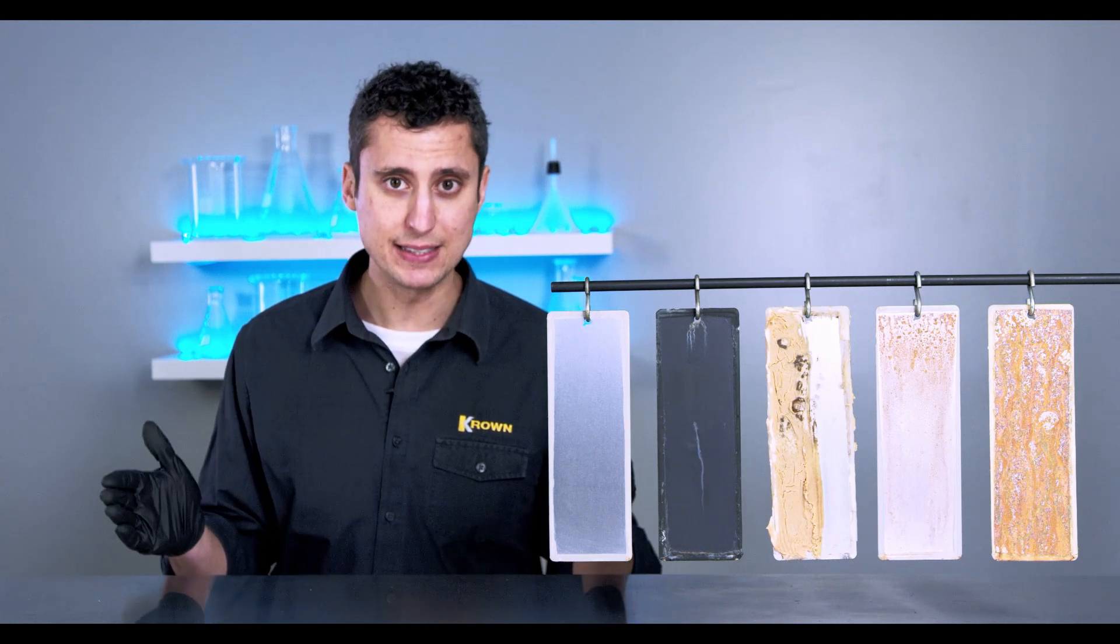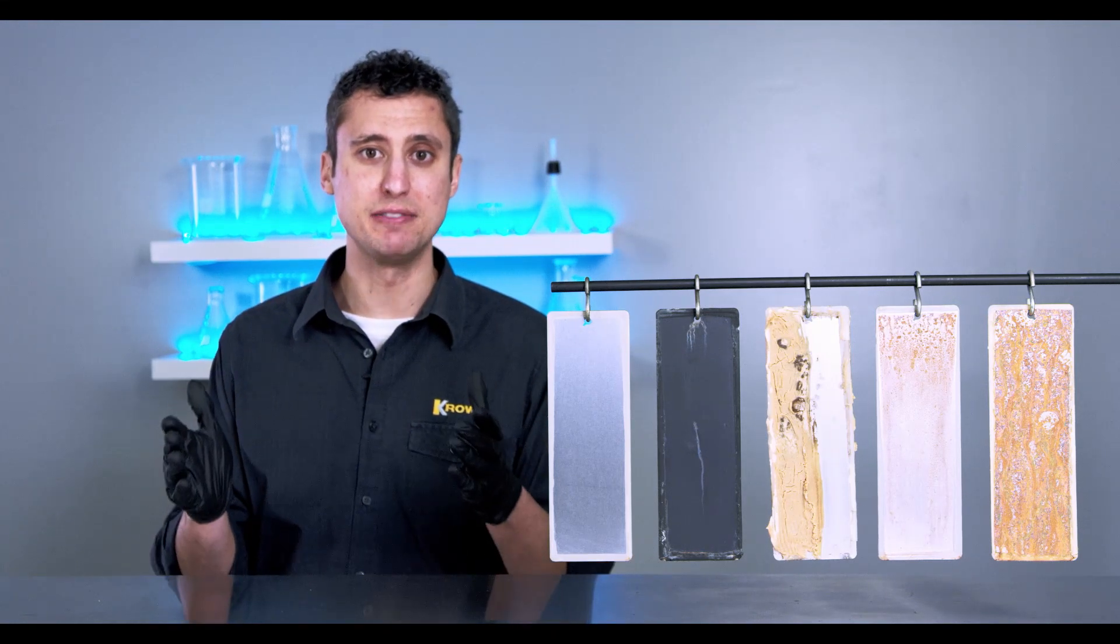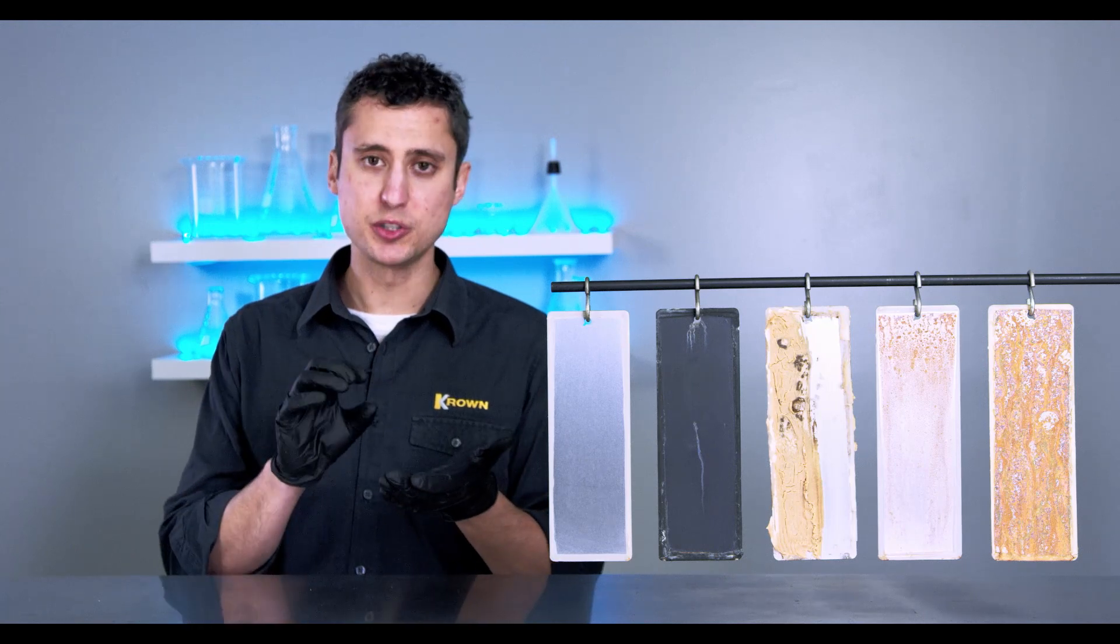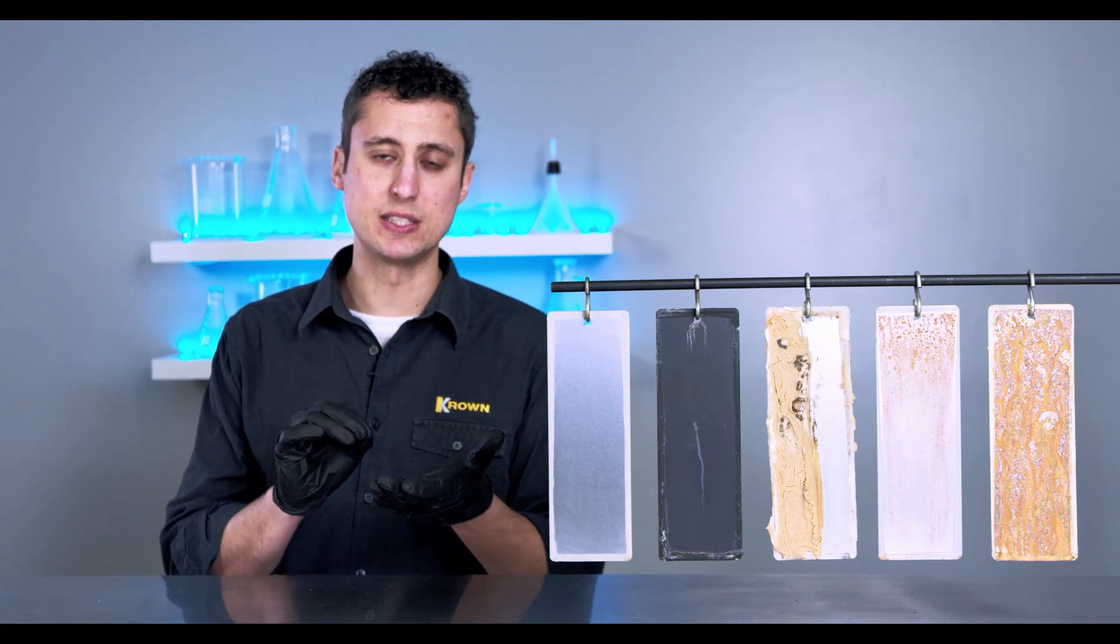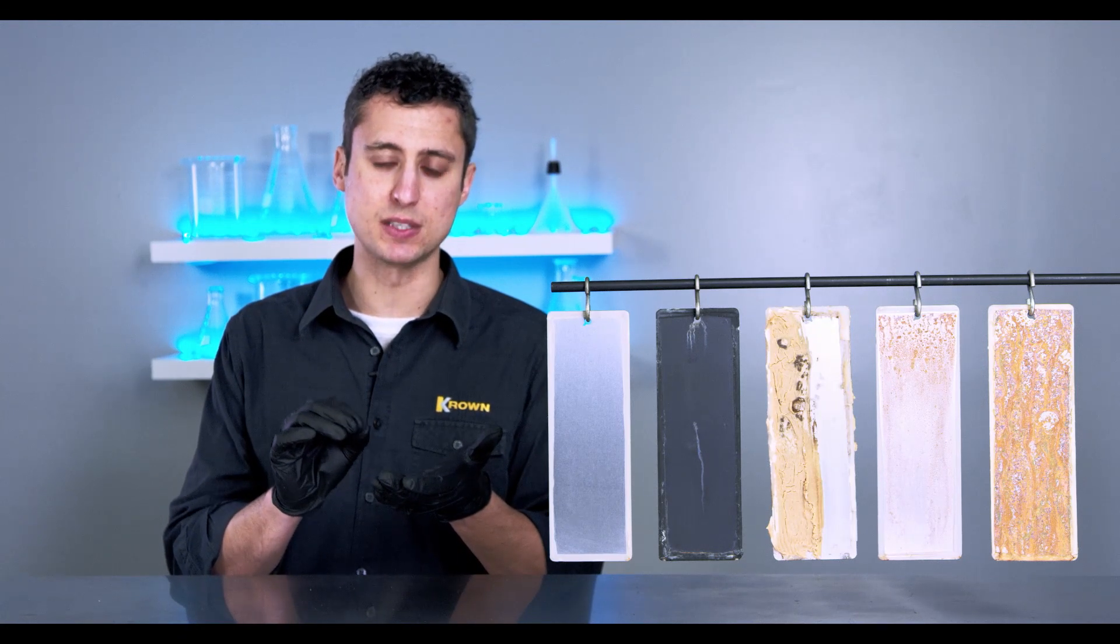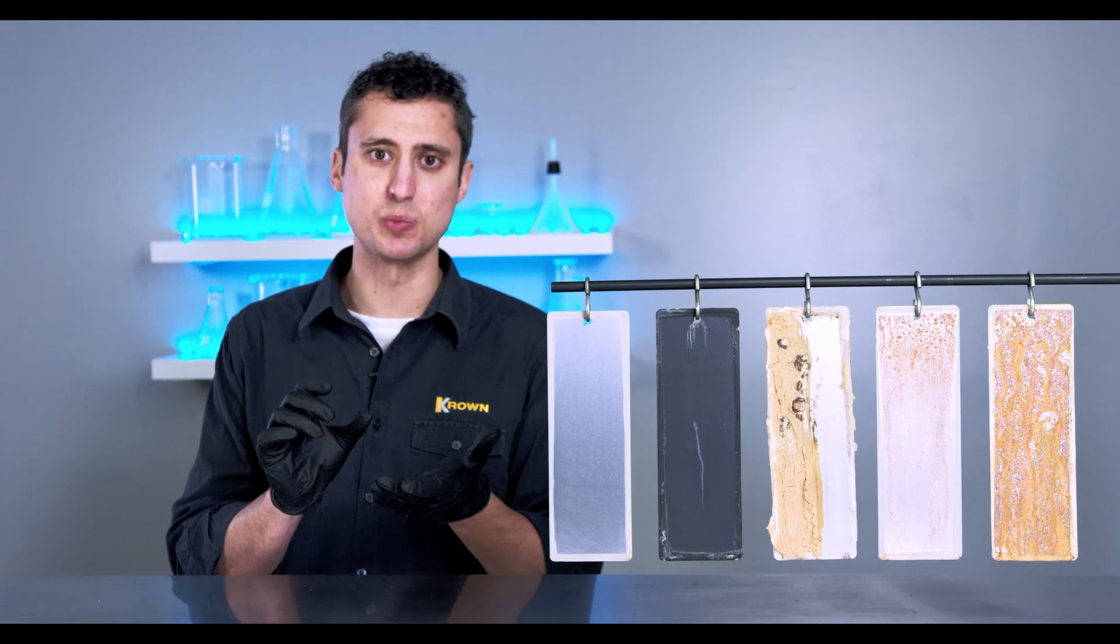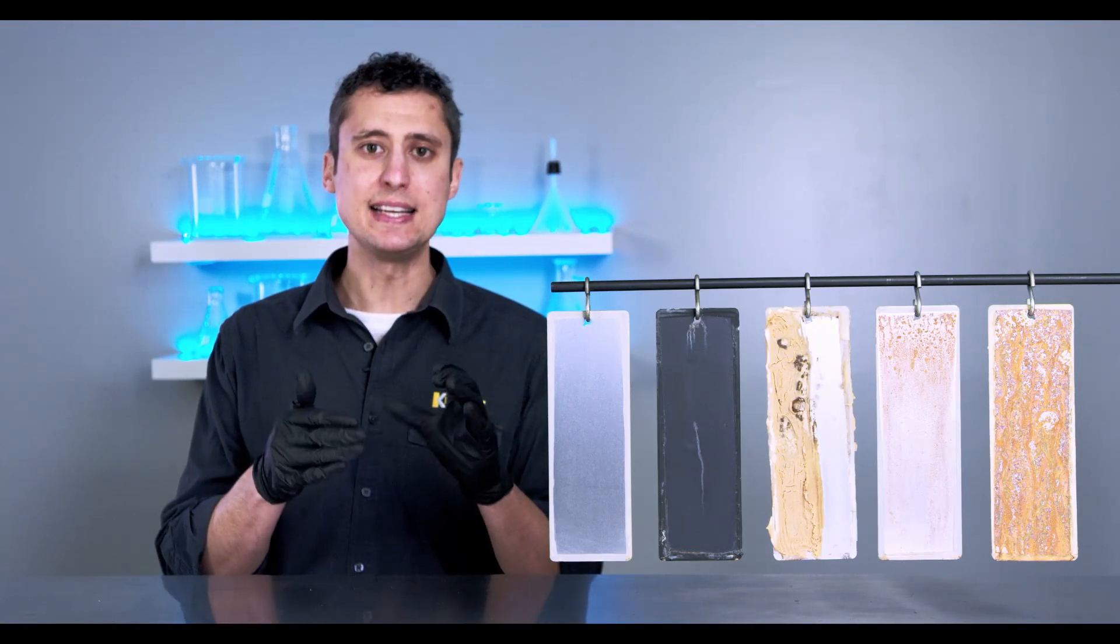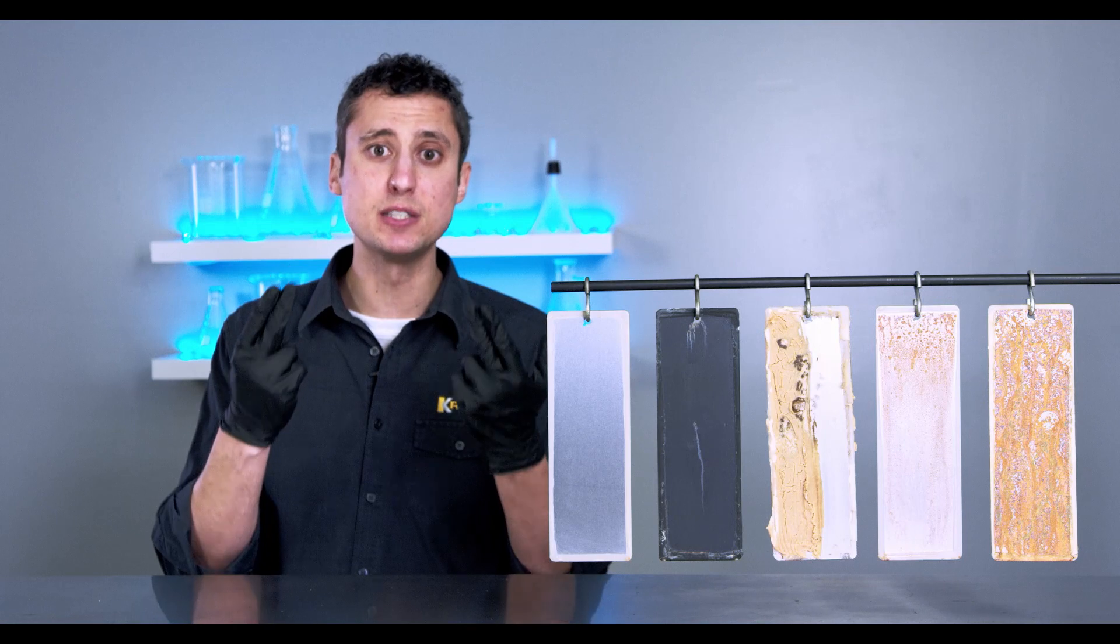There's all sorts of nooks and crannies, there's hidden spot welds and seams, small electrical components, as well as the inside of door panels, these areas that you can't see are invisible to the naked eye.